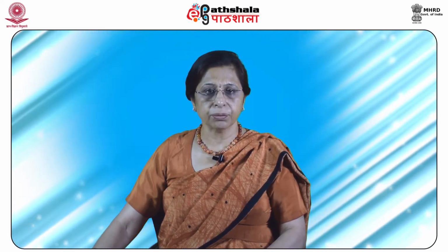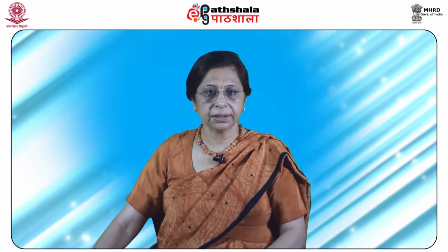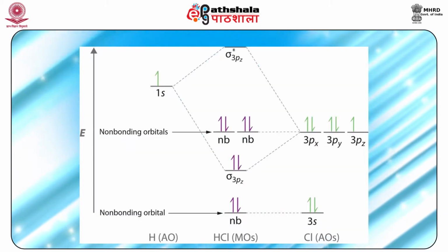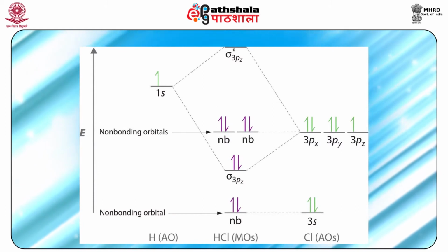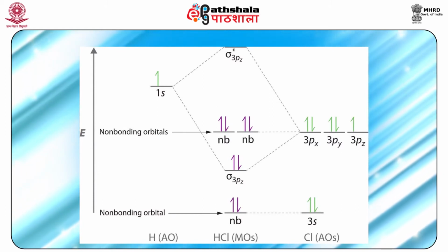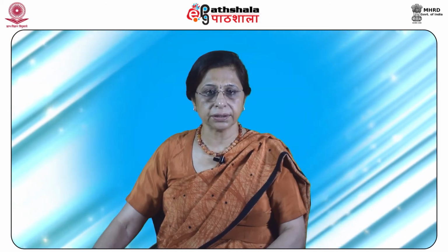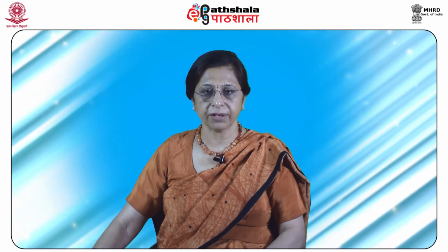Another type of chromophores are alcohols, ethers, amines and thiols. All these compounds consist of a non-bonding pair of electrons, thus transitions of the type n to sigma star become important. This transition is of high energy and takes place at short wavelength.